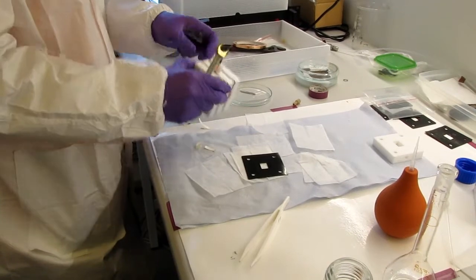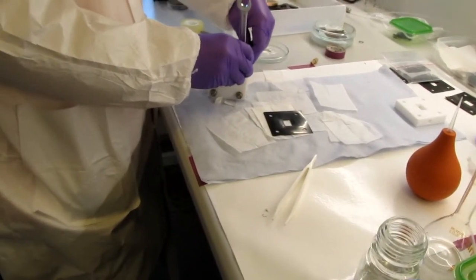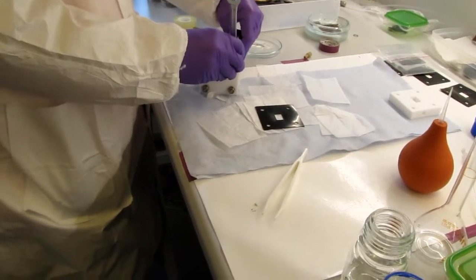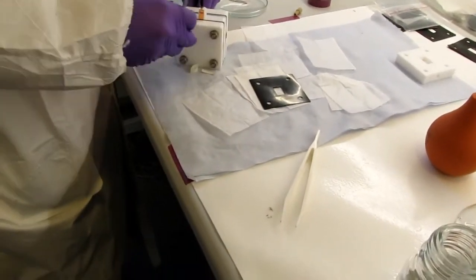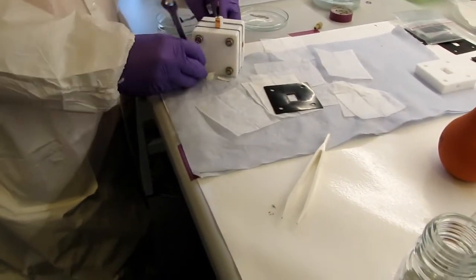This is a homemade cell. It's super cheap, only, I think, less than $1,000. Very cheap. You see the configuration is super simple. It's very cheap, but it works so far.